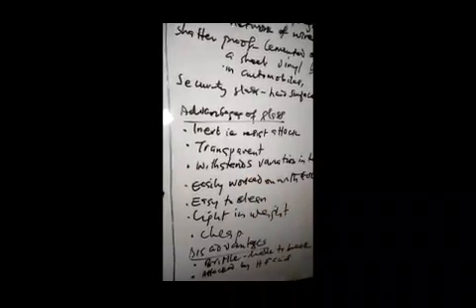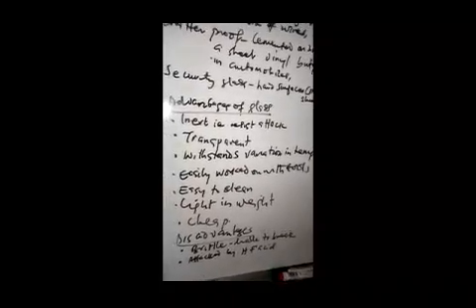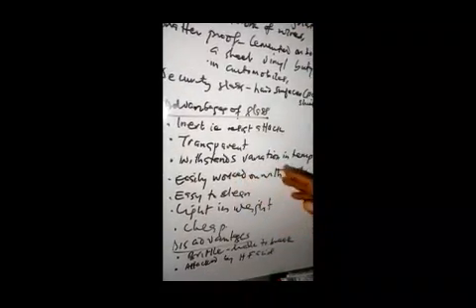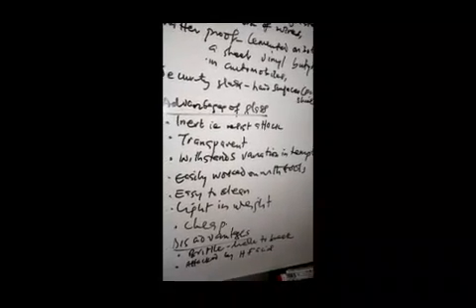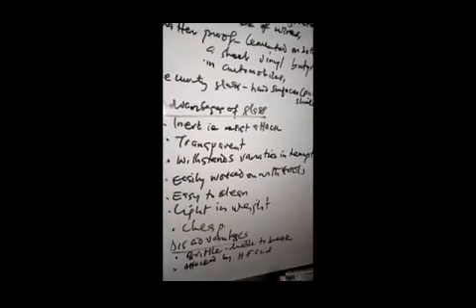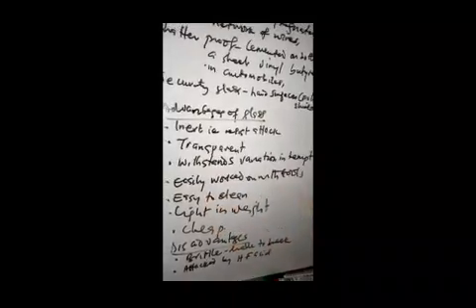They withstand variations in temperature. You can keep them in a room temperature of 25 degrees, bring them under the sun at a temperature of 45 degrees, even heat them, and they can resist. They can withstand variations in what? Temperature. They are easily worked on with tools. They are light in weight. They are easy to clean. And generally, glasses are what? Cheap. If you go to a ceramic industry, a place where they make glasses, glass is one of the cheapest products to make. In these days of entrepreneurship, students are encouraged to go into glass making, because it's a cheap technology.